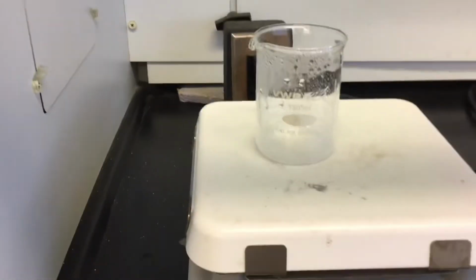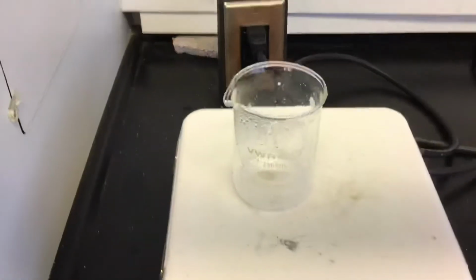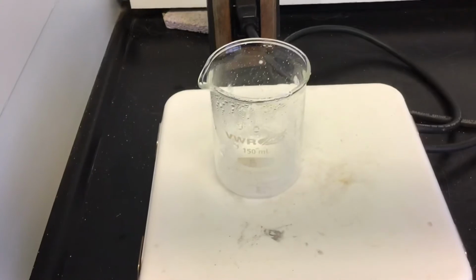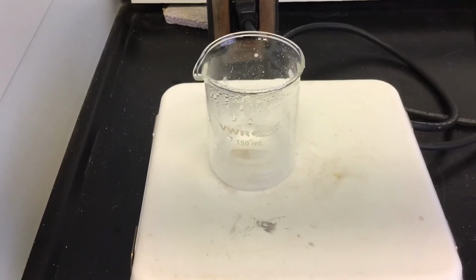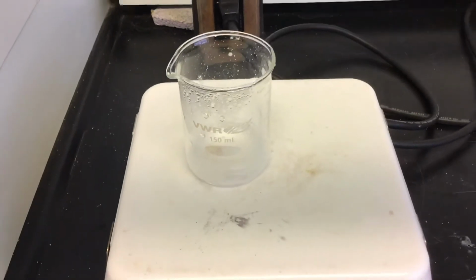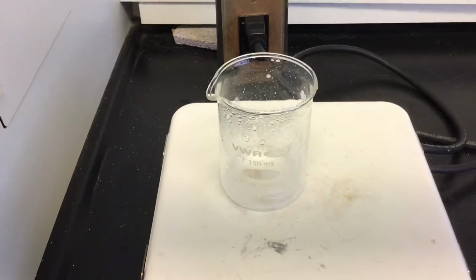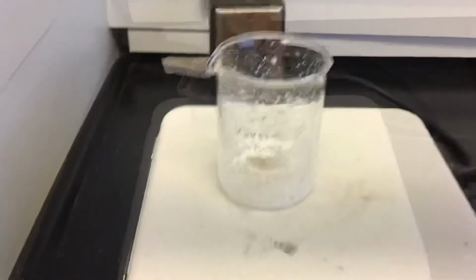You can see how the water level is getting low in there, and it's going to start splattering just like the sand did. So I'm going to go get a watch glass and put it on top. So hopefully we are not going to lose any of our salt. But you can see how there's some white speckles starting on the back of that beaker. And so we'll get that watch glass to work.